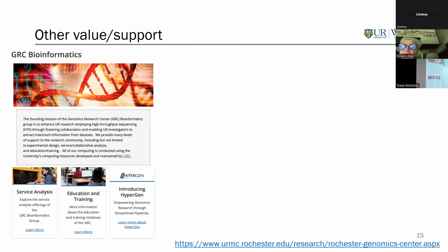We also list our education and training opportunities. Whenever we have a seminar or workshop, we post that there. We're trying to post the slides as well. But importantly, we've also acknowledged that not everybody can come to those workshops, seminars, or even the curriculum. Some people need access to something to help them do their own research in their own time at their own pace. So we worked with Wilmot Informatics to launch a research data portal called HyperGen.